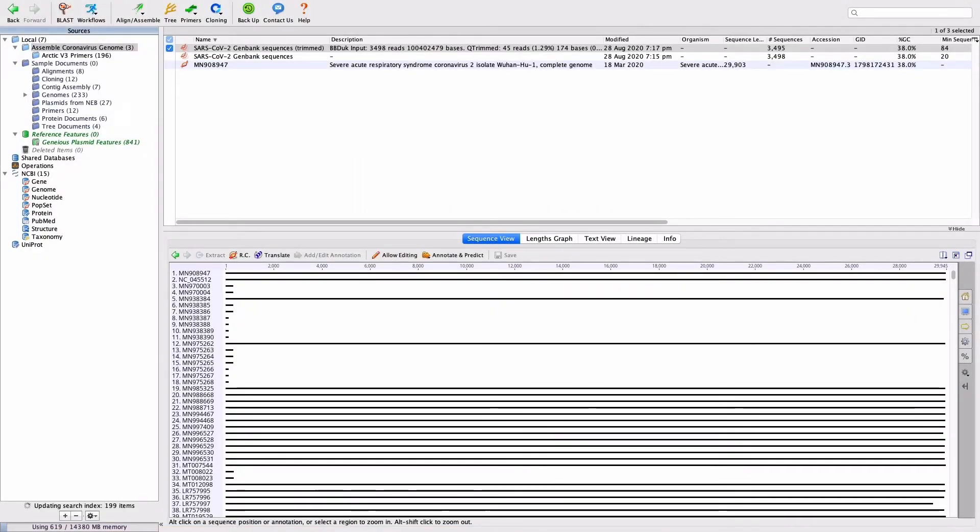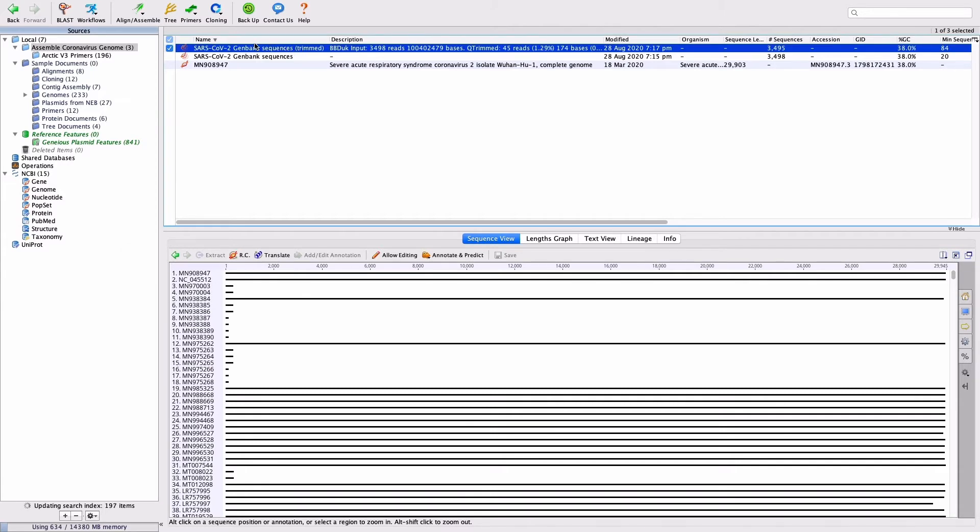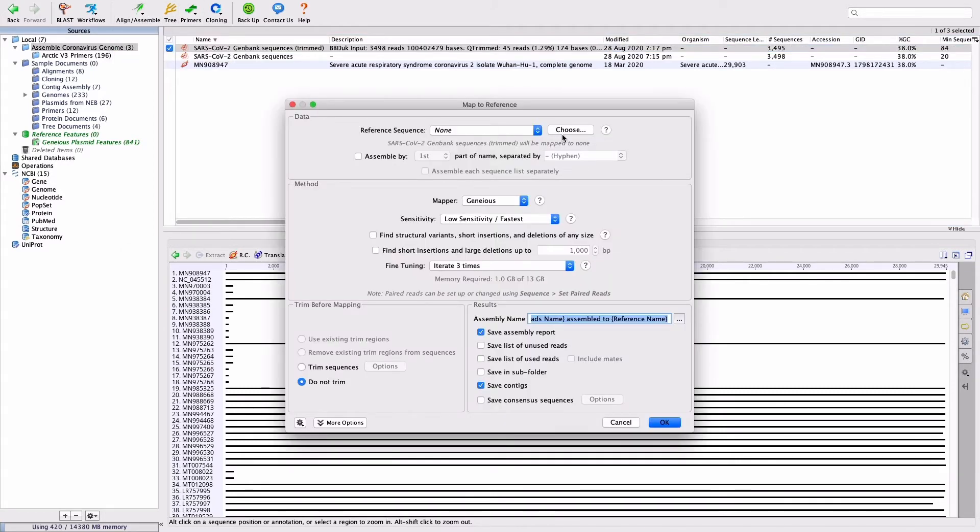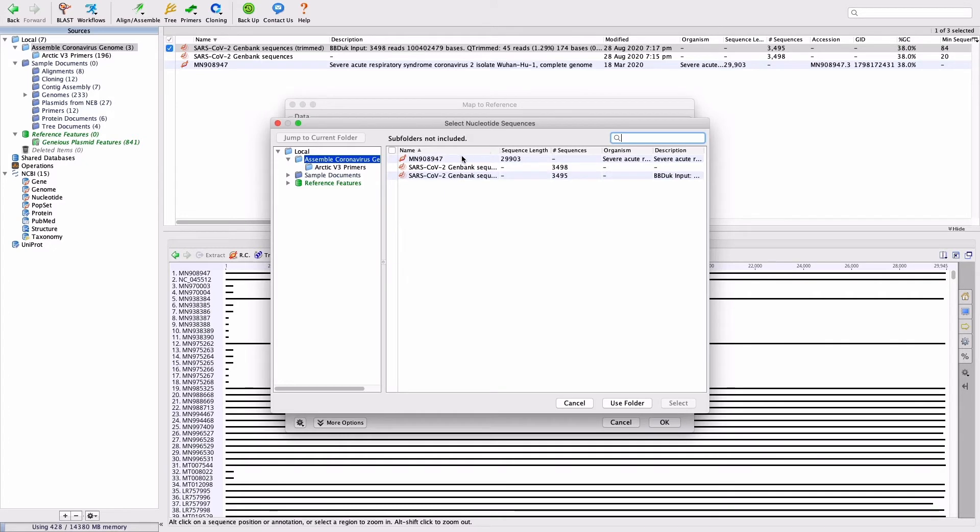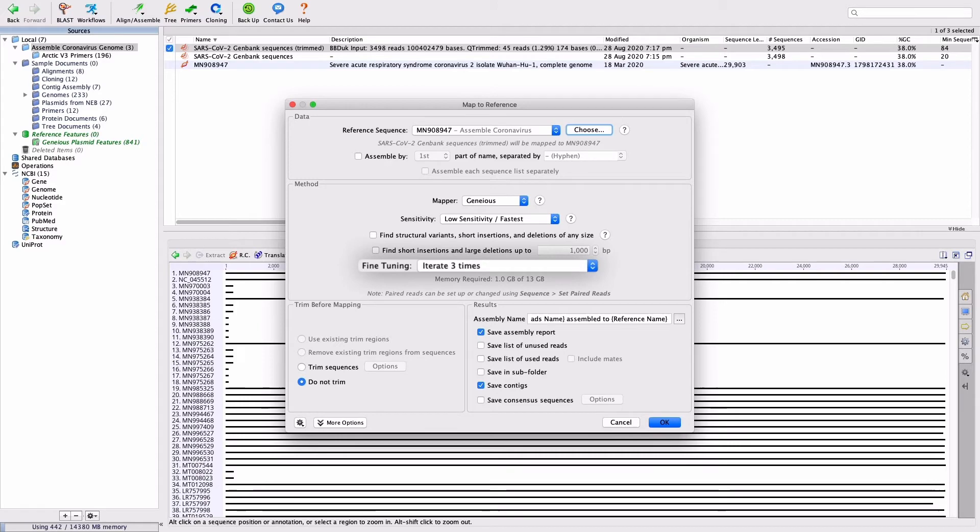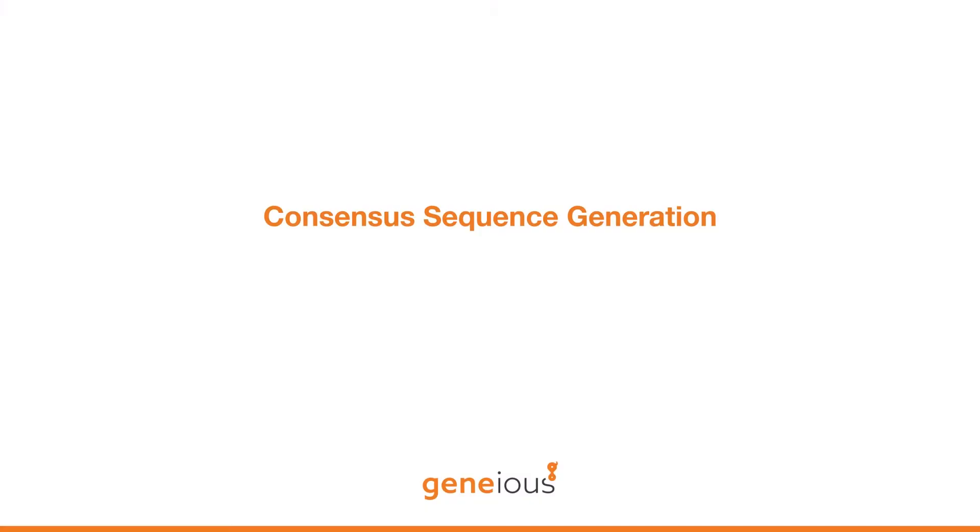The reference genome for SARS-CoV-2 can be obtained from NCBI. The accession number is MN908947. To map your trimmed reads to the sequence, select the file of trimmed reads and open Map to Reference under the Align Assemble button. Set the reference sequence in the reference chooser and set Sensitivity to Low and Fine-Tuning Iterations to 3.